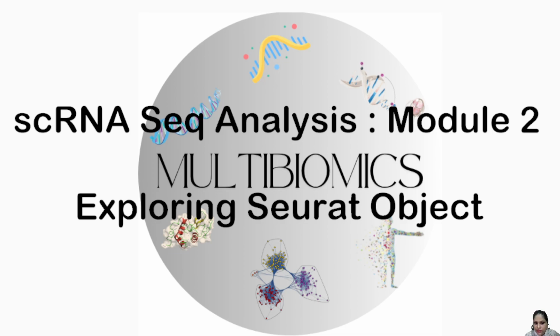By the end of this module, you'll be comfortable accessing and interpreting the essential components of your single cell dataset, setting a strong foundation for downstream analysis like clustering and differential expression. So let's get started.